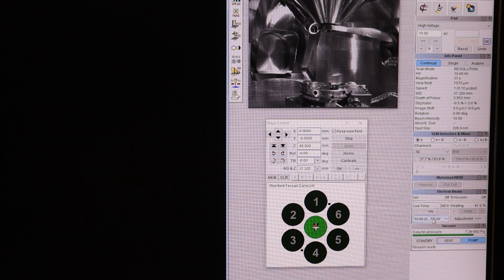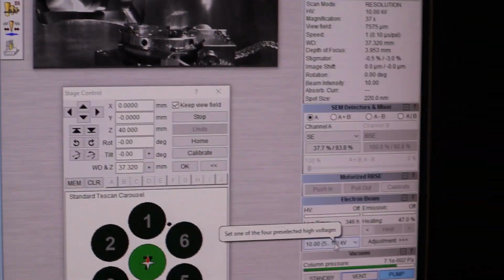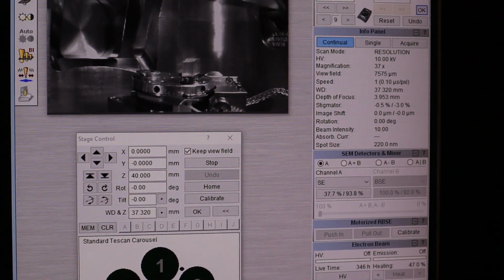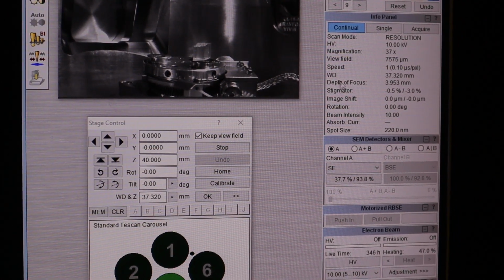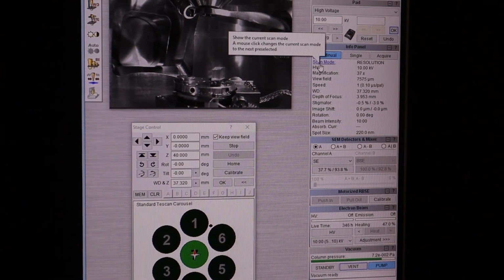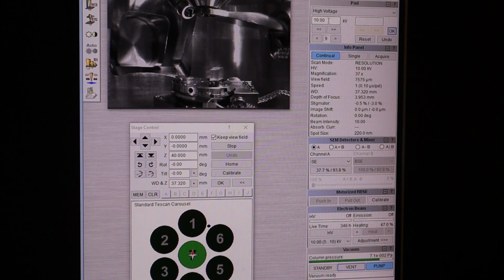microscope up. First thing you have to set is the accelerating voltage. You set that in the top right here of the screen where it says HV. So all of the beam controls are here. So the first thing we want to set is the accelerating voltage. So you will click on HV or high voltage with this, and it brings up this window here.